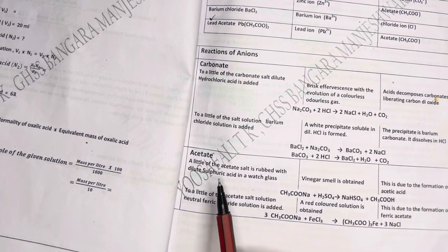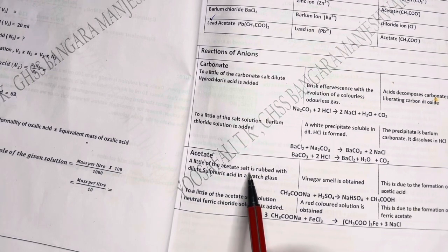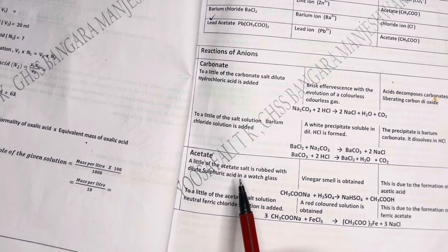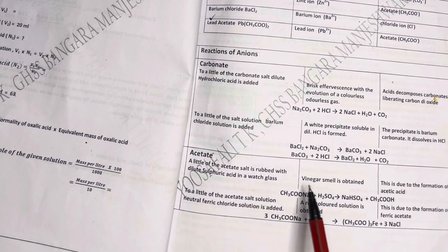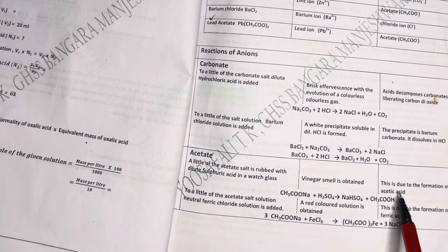And again, the confirmatory test for the acetate. A little of the acetate salt is rubbed with dilute sulfuric acid, so you have to take a little of the given salt and rub it with dilute sulfuric acid on a watch glass, using a glass rod. If you get a vinegar smell, then this is due to the formation of acetic acid. And this is the reaction. You have to study the reaction as well.